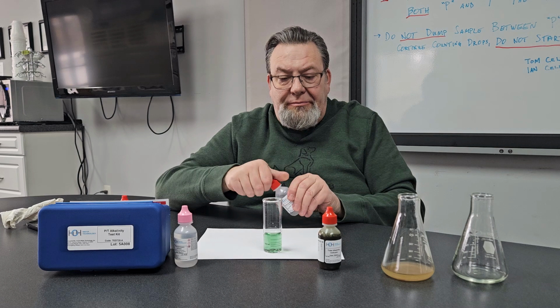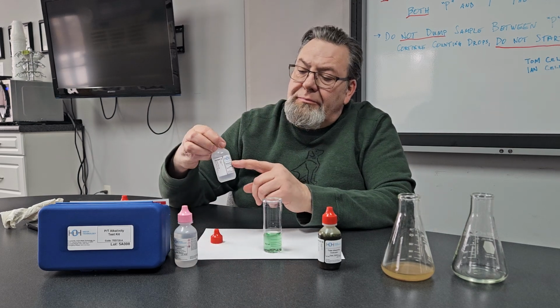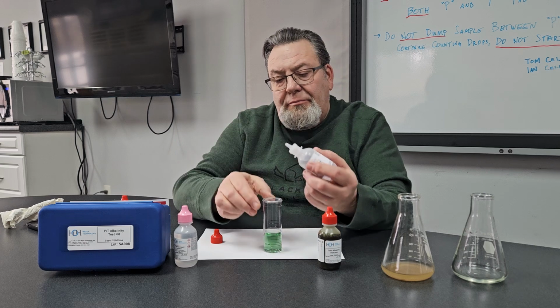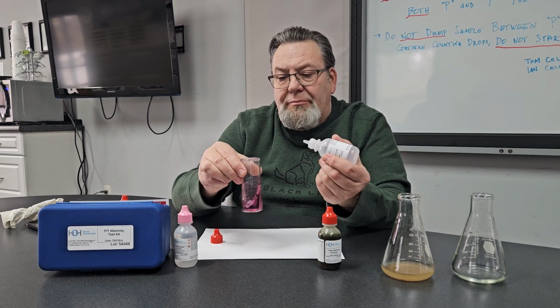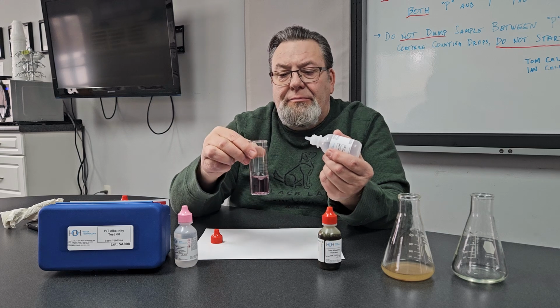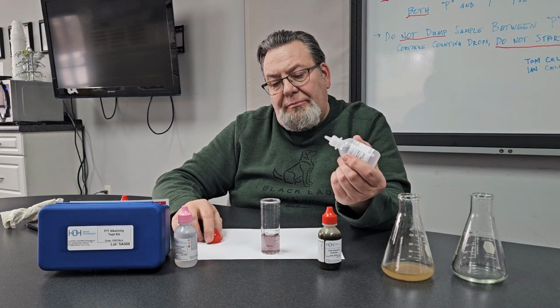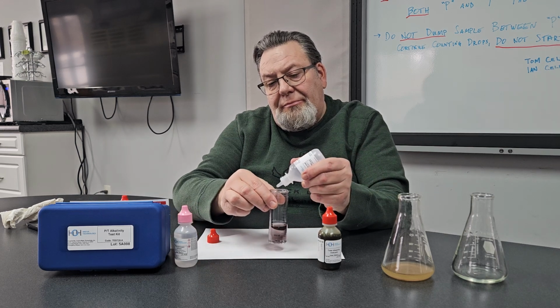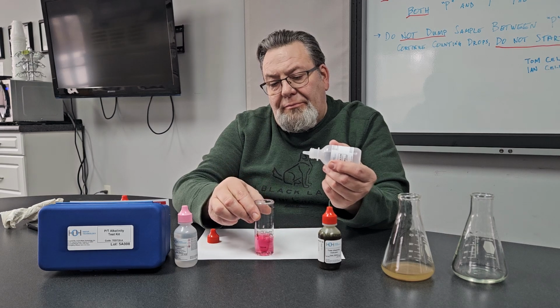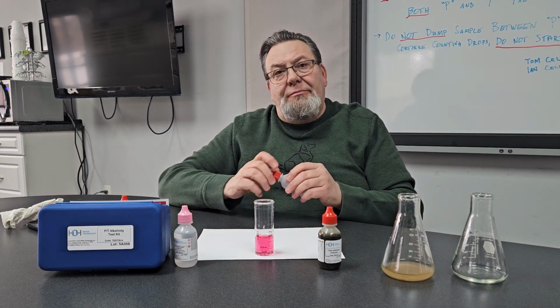To this, add the same sulfuric acid, 50 part per million per drop titrating solution. We're going to continue counting from where we left off. The next drop will be 7. Wait for just 1 second, as often the sample can revert to a green color. In this case, it's in between, so we'll add 1 more drop. And you'll see it goes immediately to the pink-purple that we're looking for. That was 8 drops total.